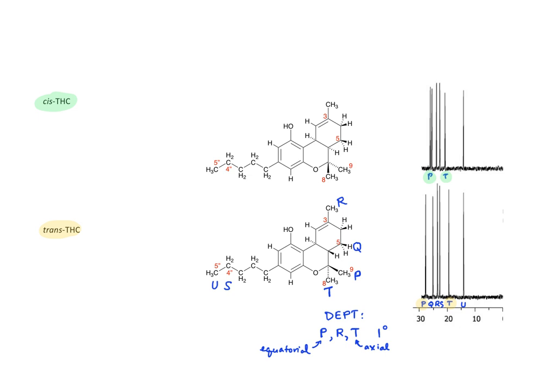While I've attempted to make claims for all of the carbons, some claims are stronger than others. Some of the claims are relatively weak and should be considered hypotheses. But at least we have a starting place now when we get additional information from other two-dimensional NMR experiments.